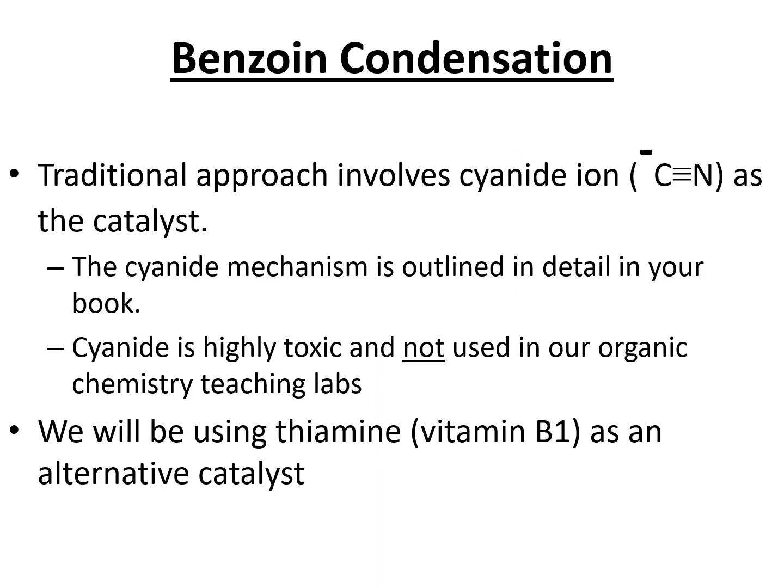So in the benzoin condensation, as in many condensation reactions, the action of a base is very crucial. Normally for the benzoin condensation, a strong base like cyanide is used, but because it's highly toxic to use in the lab, we will use thiamine as an alternative catalyst for the reaction.